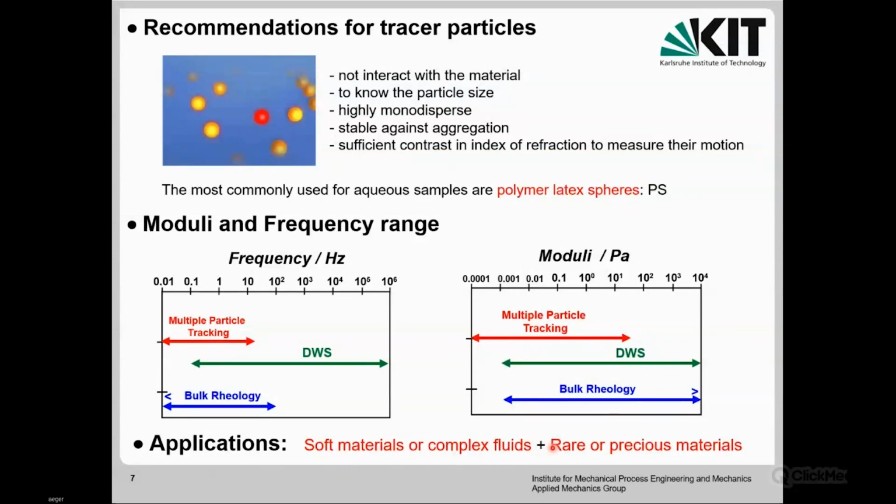Materials which are very brittle, fragile, can be measured using microrheology techniques, and in particular DWS. And also materials that cannot be produced in large quantities, like for instance DNA networks, where people can produce just 1 milliliter or less. Therefore these microrheology techniques are very useful.